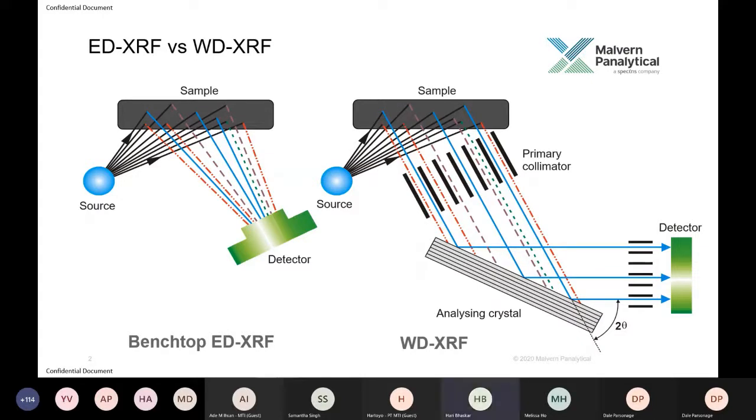And so by having this simplicity of optics, we are also having far simpler mechanisms that work in the background, which means that there is less that can go wrong and less that needs to be maintained. So it becomes a cheaper instrument and a low-cost operating option.